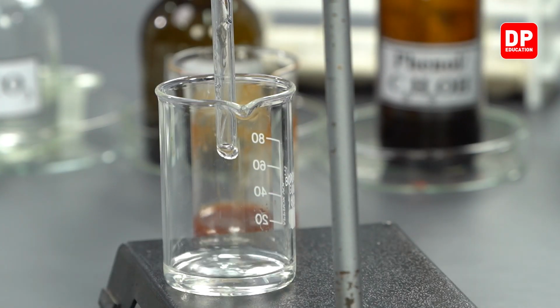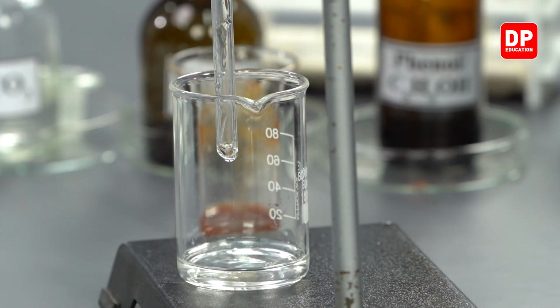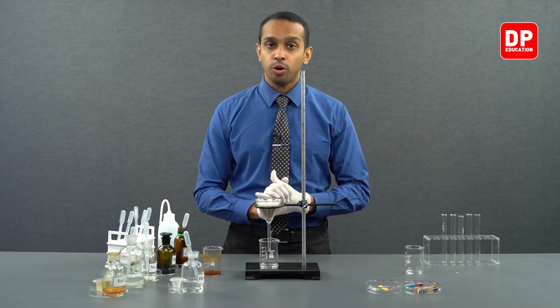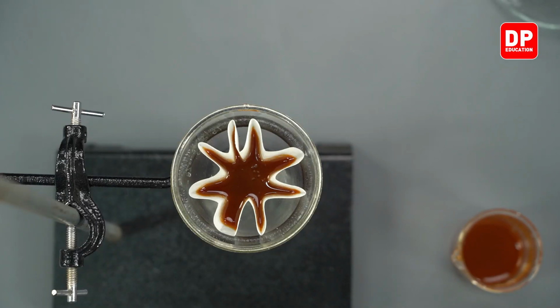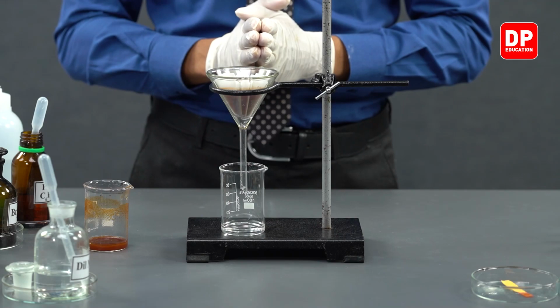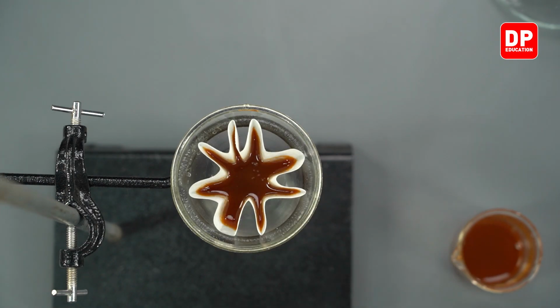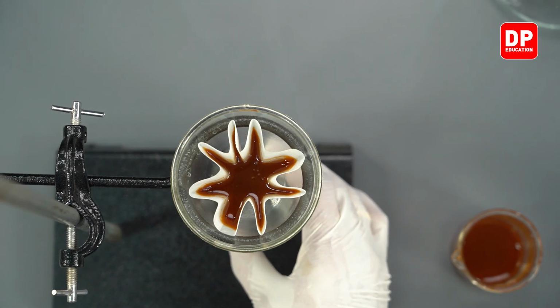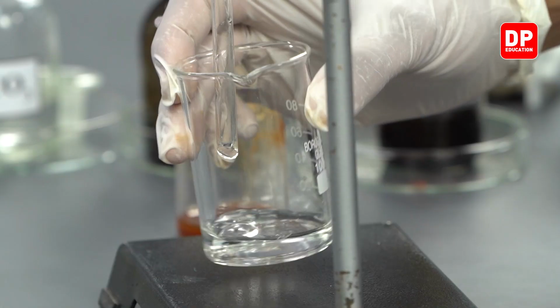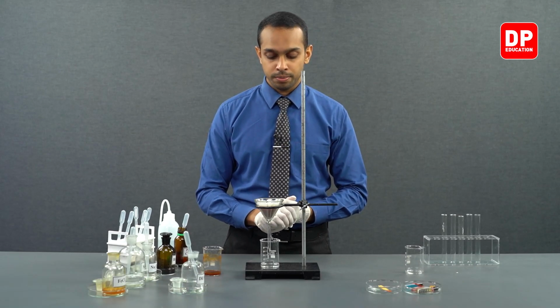Let us filter out the ferric chloride neutral solution completely, and I will show you the brown color precipitate that we have on our filter paper. That brown color precipitate that you will be seeing on the filter paper is ferric hydroxide. You can see the filter paper is now coated with a brown color precipitate that is our ferric hydroxide, and in our beaker is a supernatant or the filtrate that is going to be our ferric chloride neutral solution.